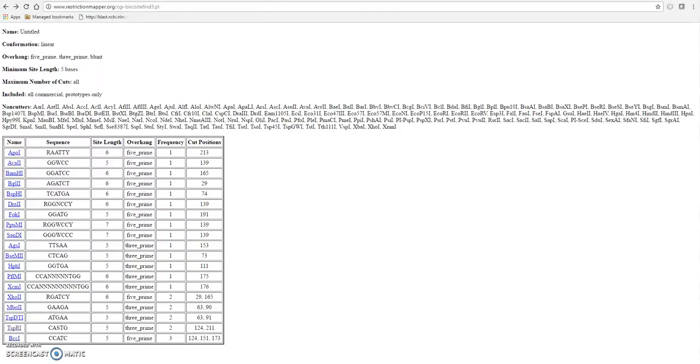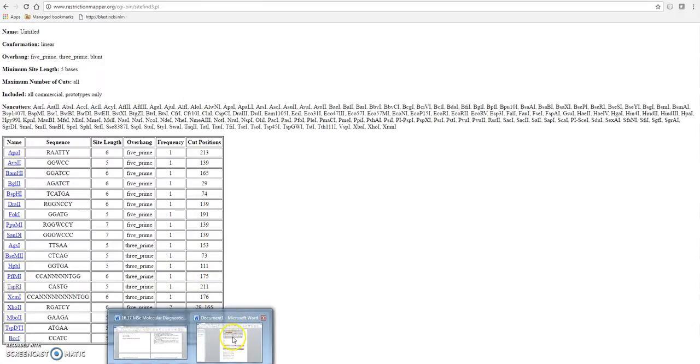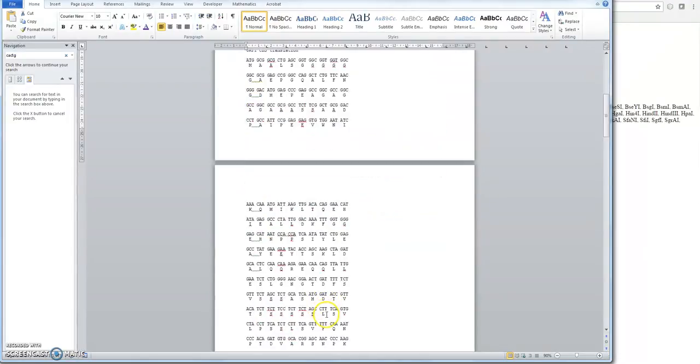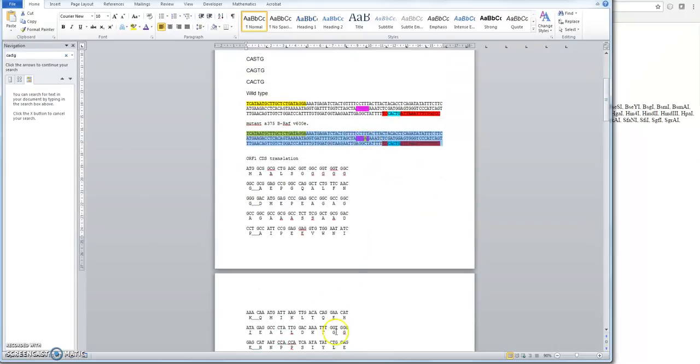So that is a wild type, that is the mutant, because what I've done is changed that T to an A, and that is the mutation that we've verified from the paper by Agami et al. That is what happens in the V600E mutation. We've also verified that this bit of DNA codes for codon 600, which is correct.